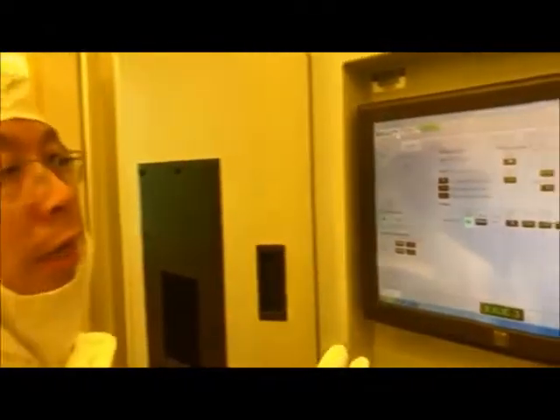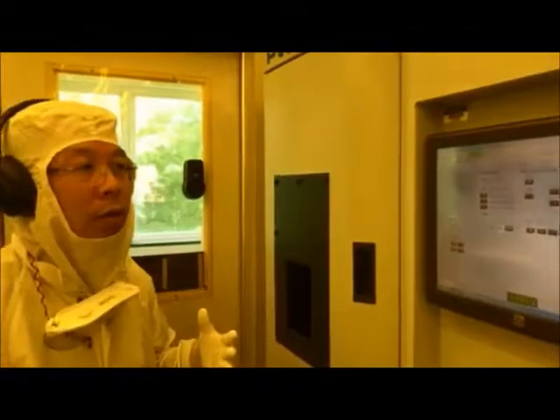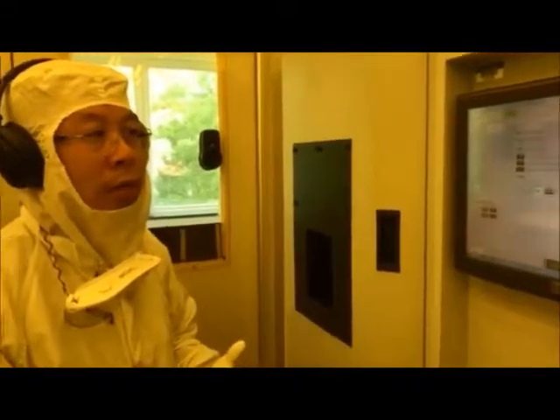And we check the plasma, still on, which is very good. We have 1 more step to go. So pressure is pretty close. The reason we have to start from 50 millitorr and low power is the plasma is easier to strike at high pressure. If we try to strike the plasma at 1.5 millitorr, most likely it won't be able to strike. So we have to strike it at high pressure and low power.